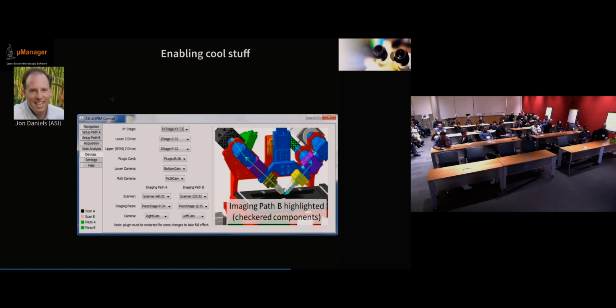He has been helped a lot because they're also doing the electronics themselves, and he has the interface. So they have complete control of that whole system, and they can nicely package it so that it really works well, but it also works very easily for users. I've trained people on this in, I don't know, less than an hour, and they're ready to use this pretty darn complicated microscope system.